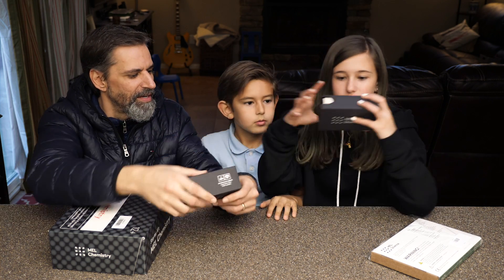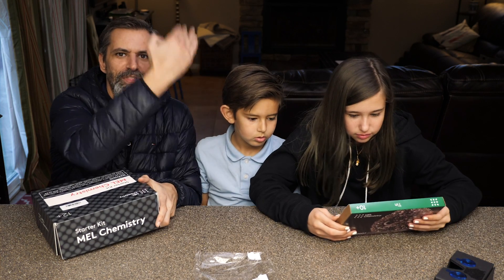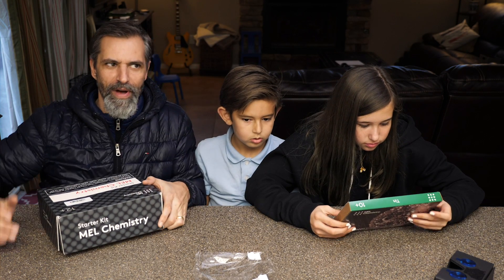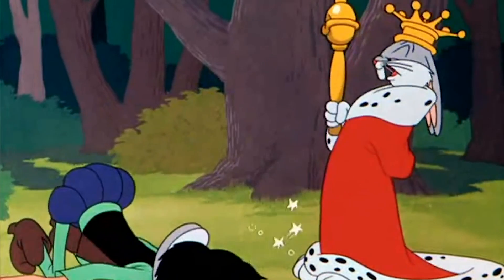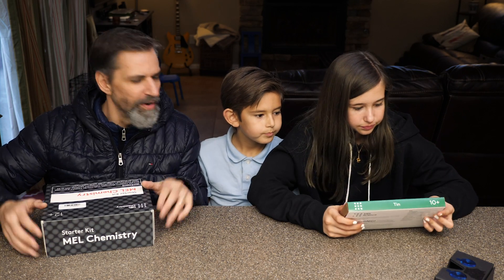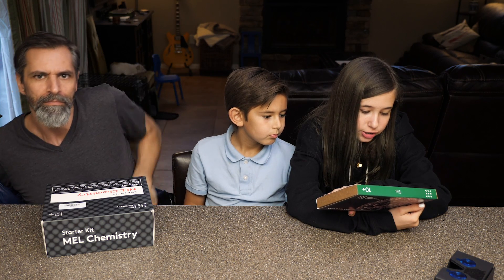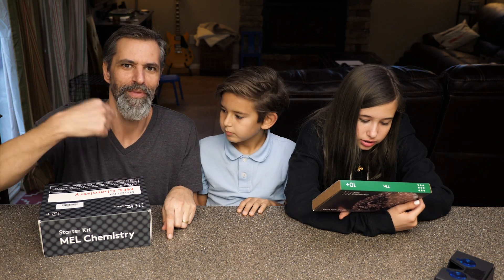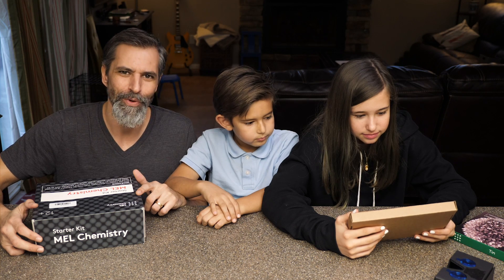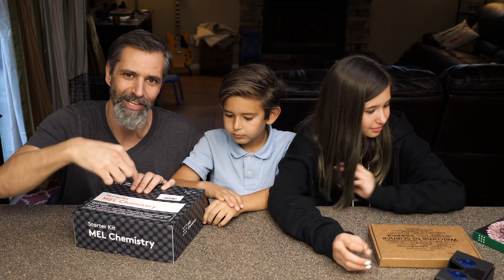We did some promo for Mel Science a few months back, and we also have a subscription where they send us the kit every month. We haven't actually sat down and done an unboxing to show you what comes in one. It says ages 12 and up, but we're gonna break some rules — I dub thee an honorary 12-year-old while your dad's here. I think we're doing this out of order — let's open up the main kit and see what's in here.